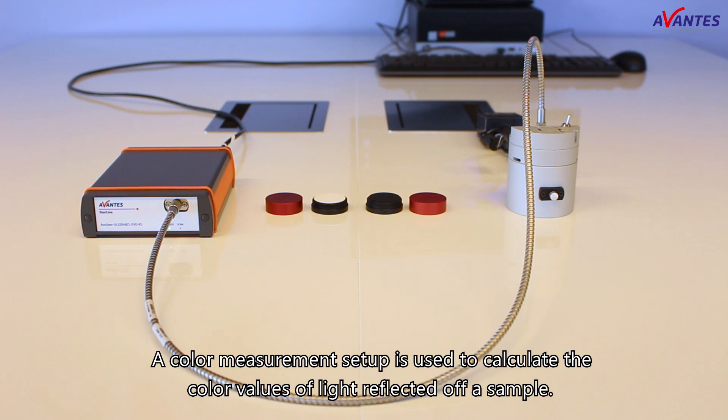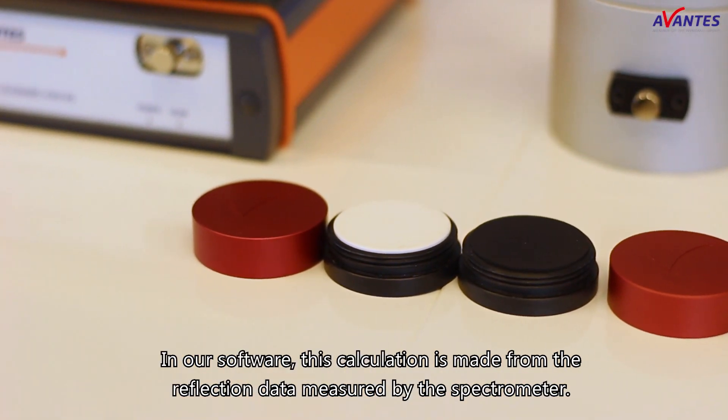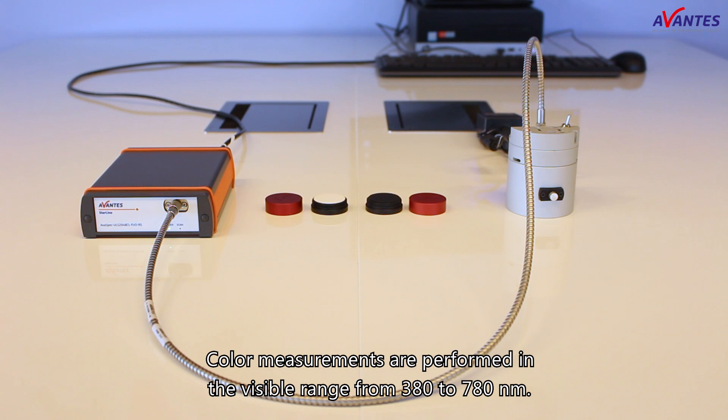A color measurement setup is used to calculate the color values of light reflected off a sample. In our software, this calculation is made from the reflection data measured by the spectrometer. Color measurements are performed in the visible range from 380 to 780 nm.